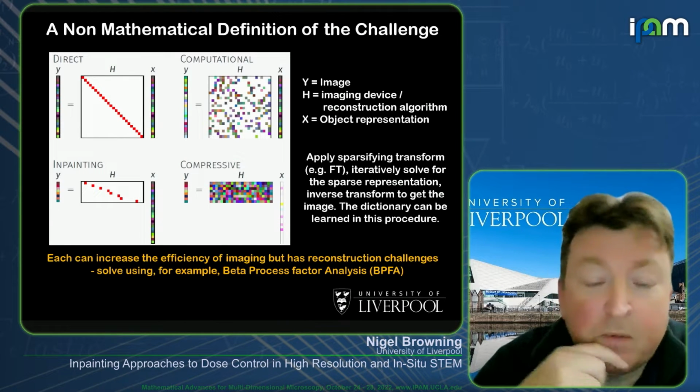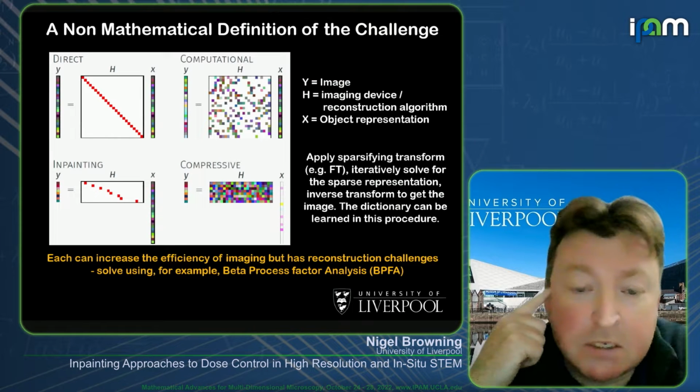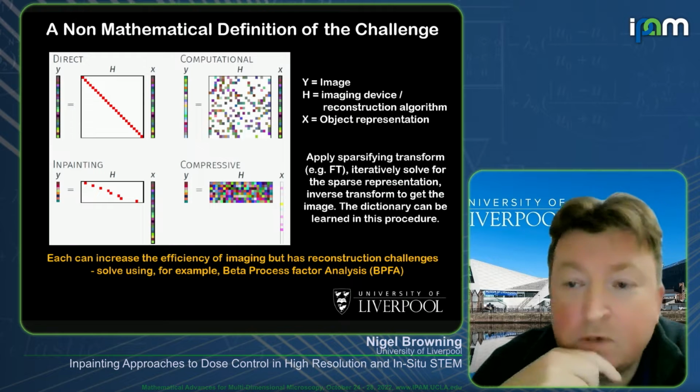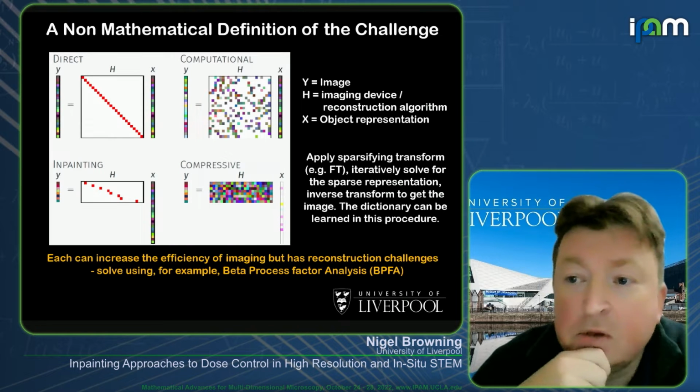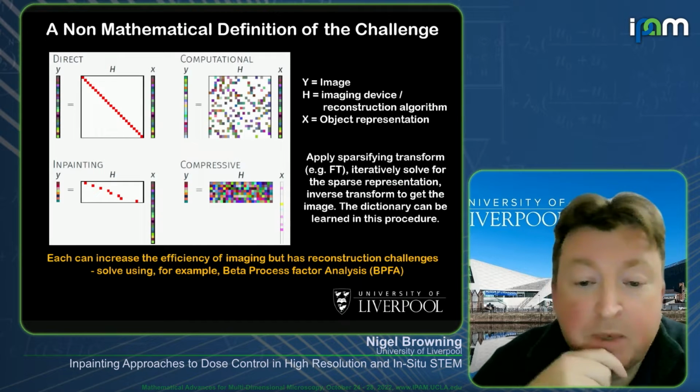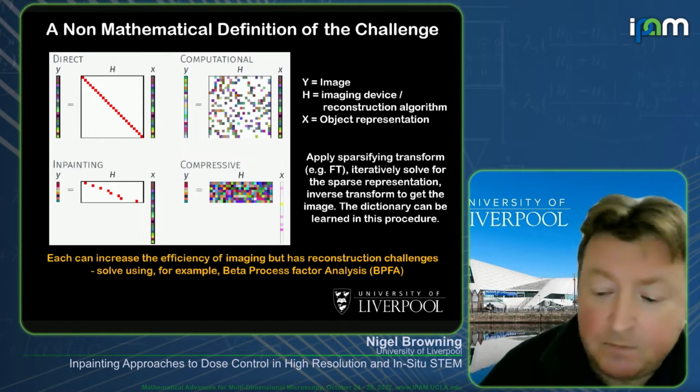This is the kind of thing that Brian Reed does and IDES specialize in doing for electron microscopy, where you have a matrix which gives you different intensities, and you use that to sample your image, and then you can reconstruct again a smaller number of samples into a much bigger set of images.